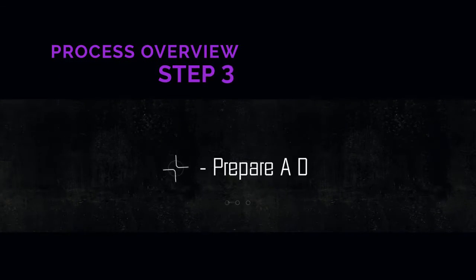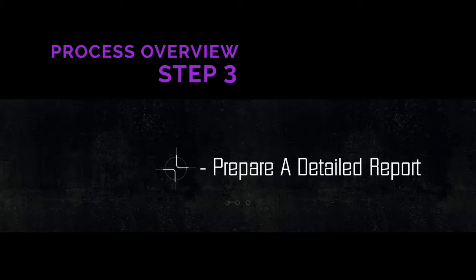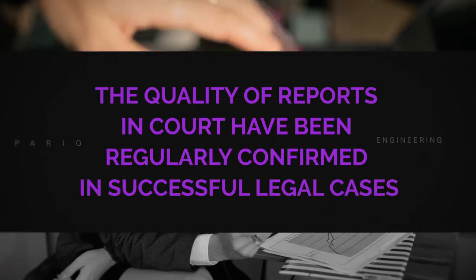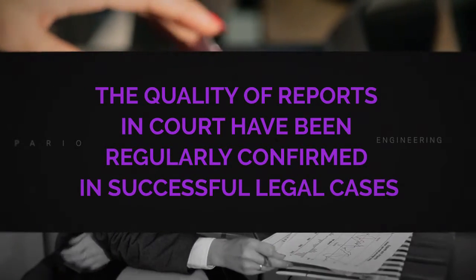The report produced for our client concludes the investigation, pinpointing the root cause of the failure in terms that the customer, our client, would be able to understand, would be able to determine which direction the further proceedings should be directed to.